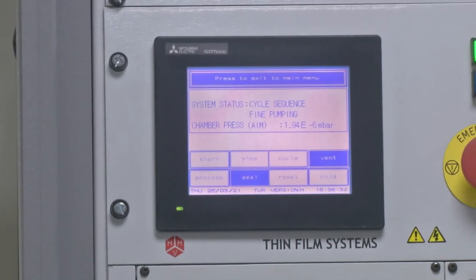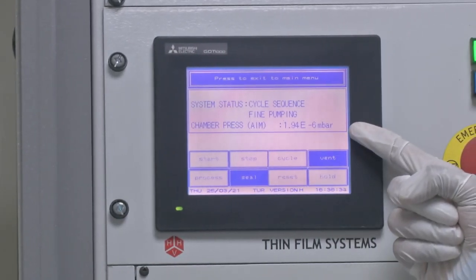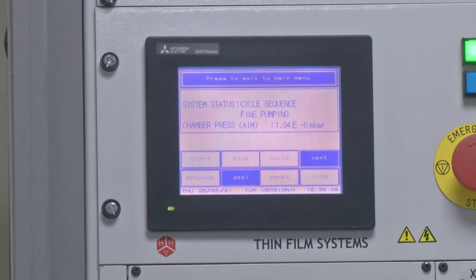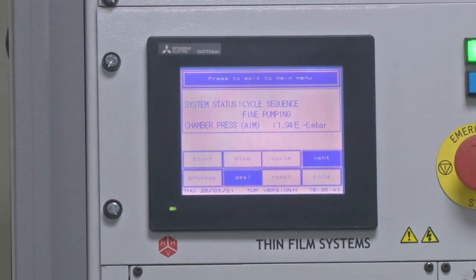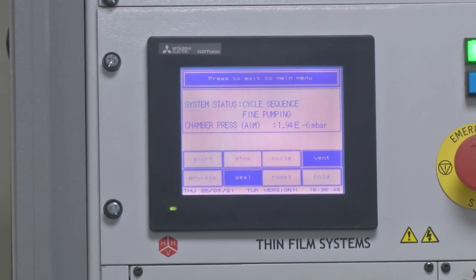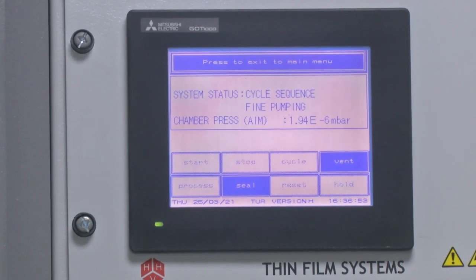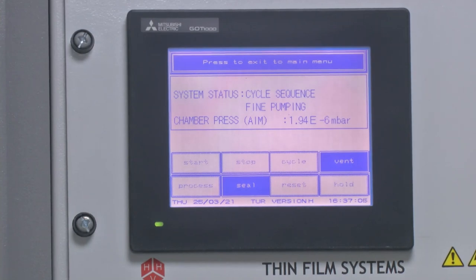The vacuum has now reached 1.94 × 10 to the minus 6 millibar. Generally, we can start the deposition process once the vacuum reaches 3 × 10 to the minus 6 millibar or less. This ensures the mean free path — the total distance traveled by the charged species from one end to the other — is maximum and the species do not collide with any impurities in between. We will now turn on the electron beam gun.